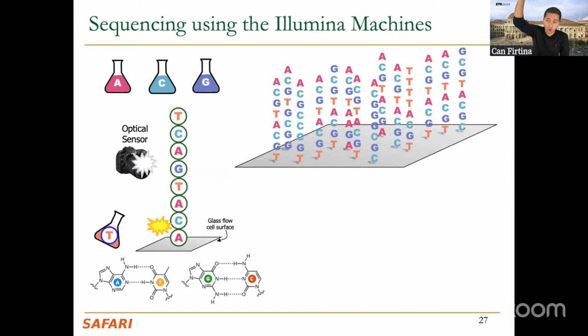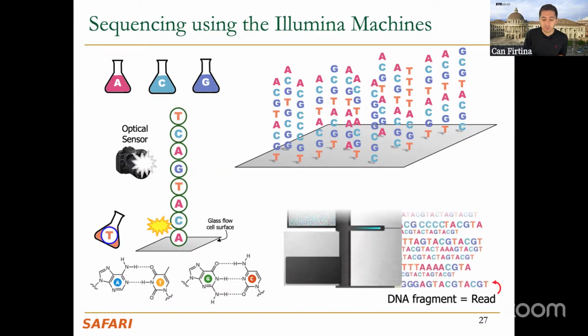But as you grow up to 1,000 bases in length, this synchronization will be gone completely. So you will generate maybe even random colors at almost random positions, so that you won't be able to tell which base was just connected at this particular cycle. So that's why, for example, sequencing by synthesis has this read length limitation.